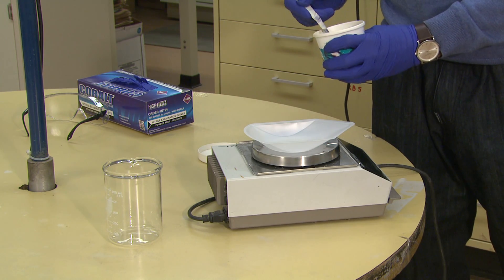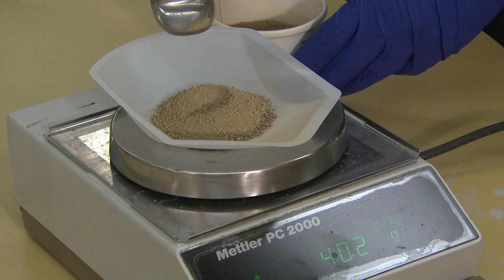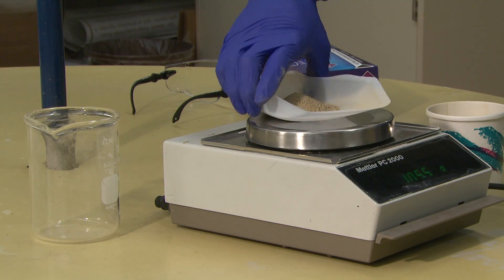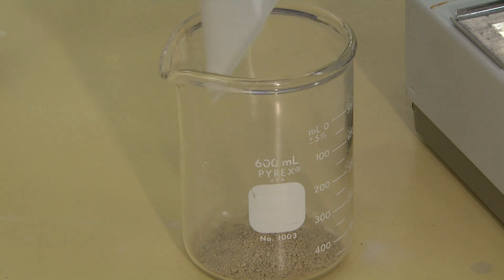The procedure begins with first mixing the sample by hand to give it a homogenous character. Then, 40 grams of sample are weighed and placed in a 600 milliliter beaker. This weight is increased for sandy soils and decreased for clay ones to utilize the measuring range on the hydrometer stem.